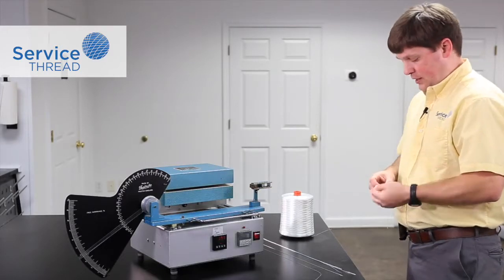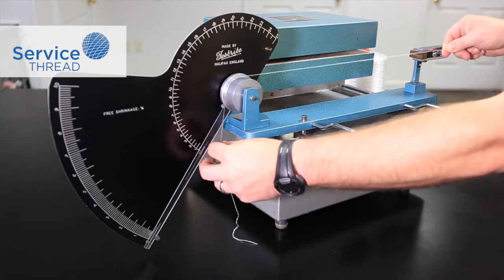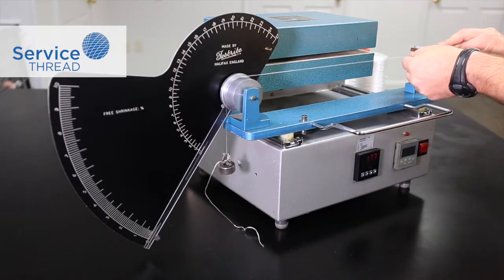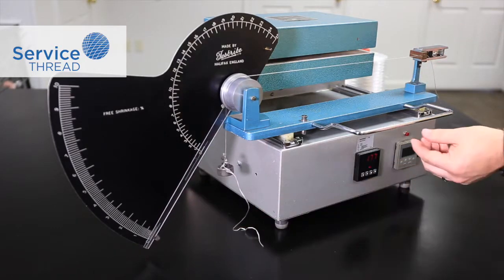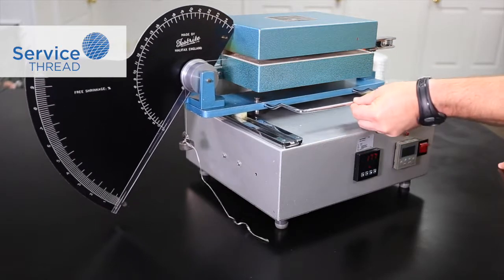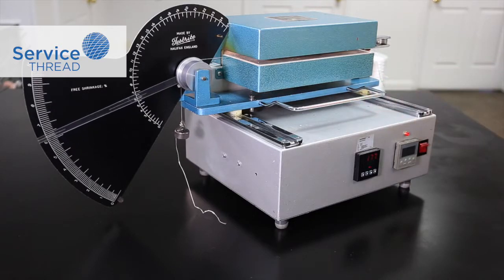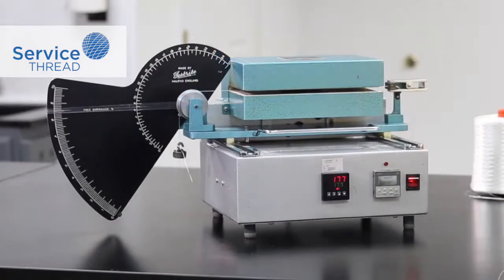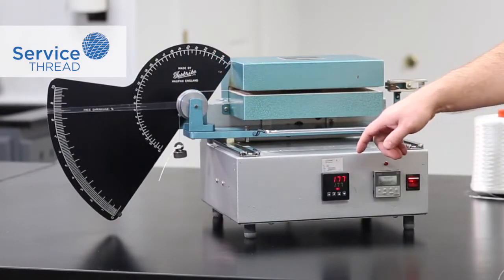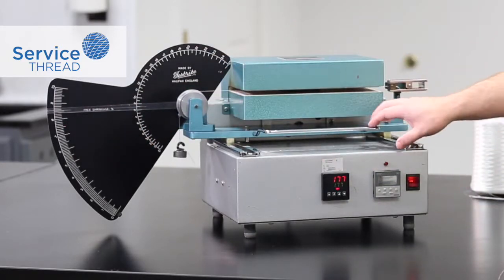For comparison, we'll look at a 1000 denier high shrinkage yarn using the same method. Again, secure the weight and fix the yarn in the clamps and start the test. As you can see, even the initial shrinkage is much higher. Reading the results on the scale, we're at about 8.5 percent shrinkage.